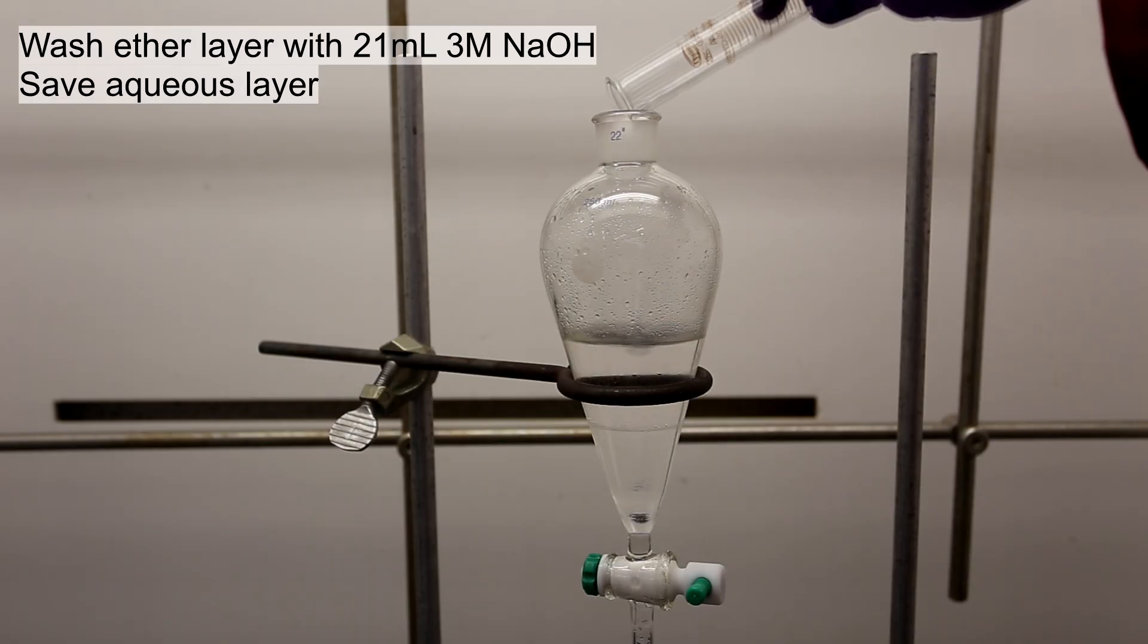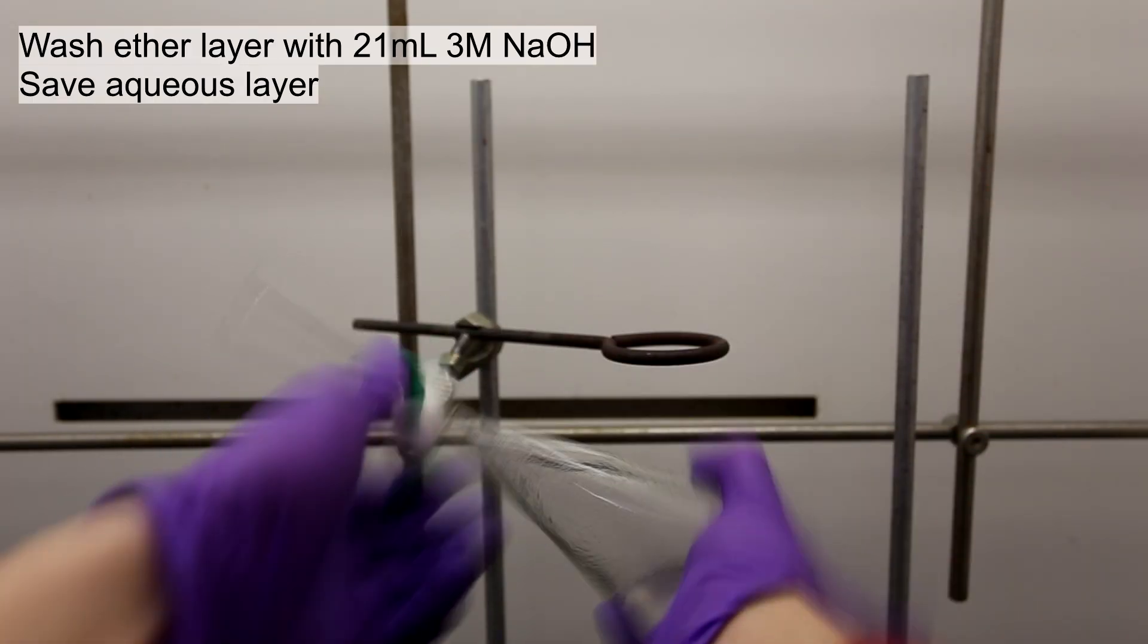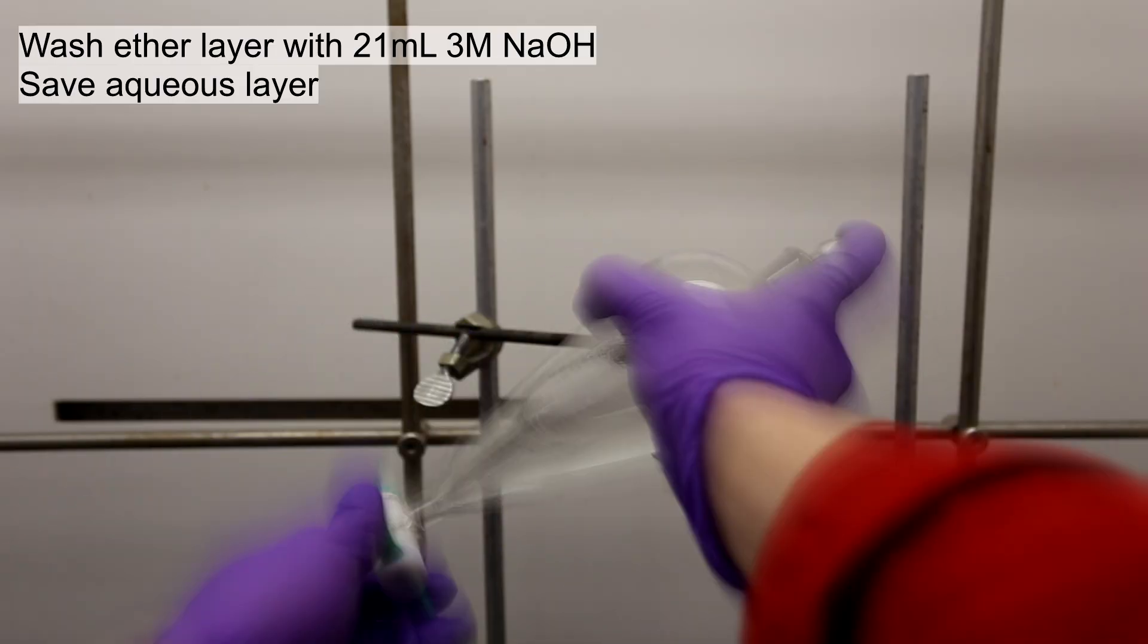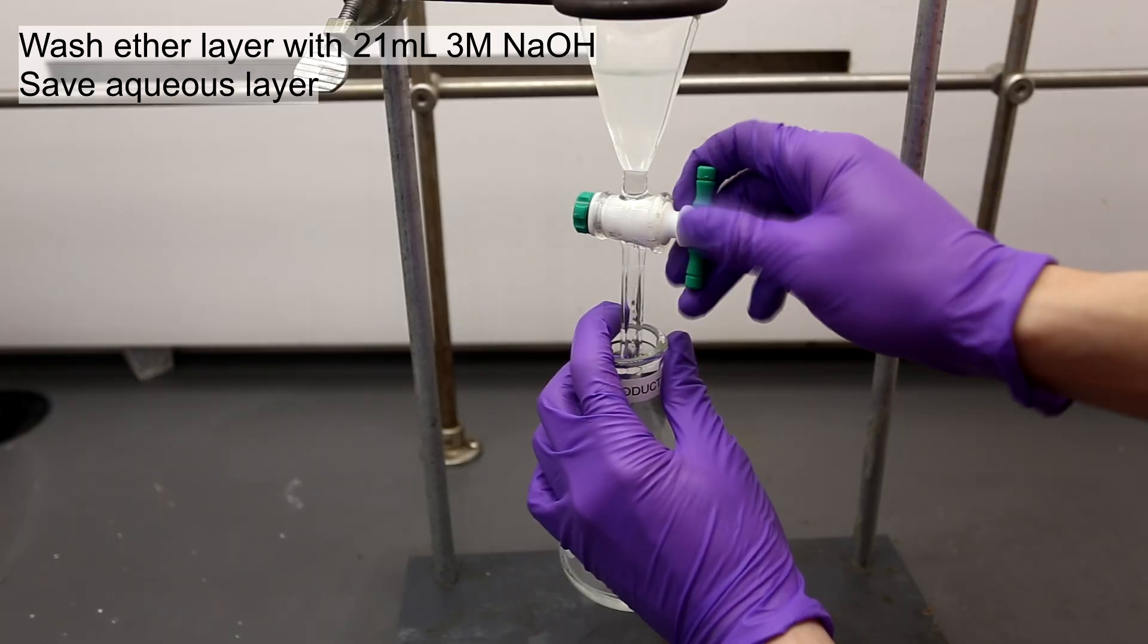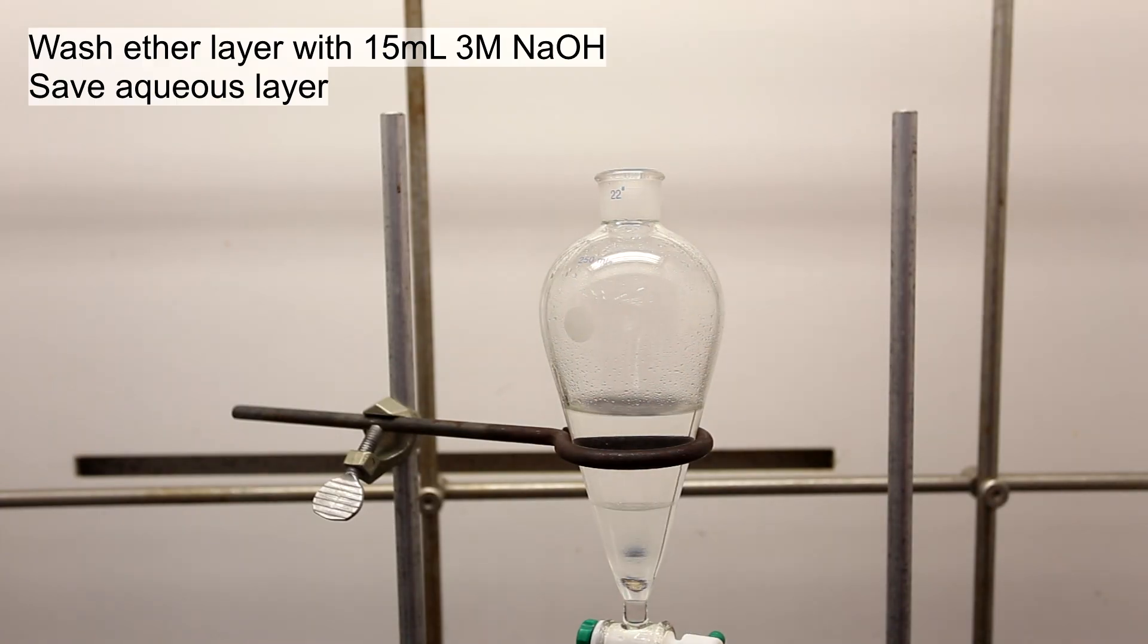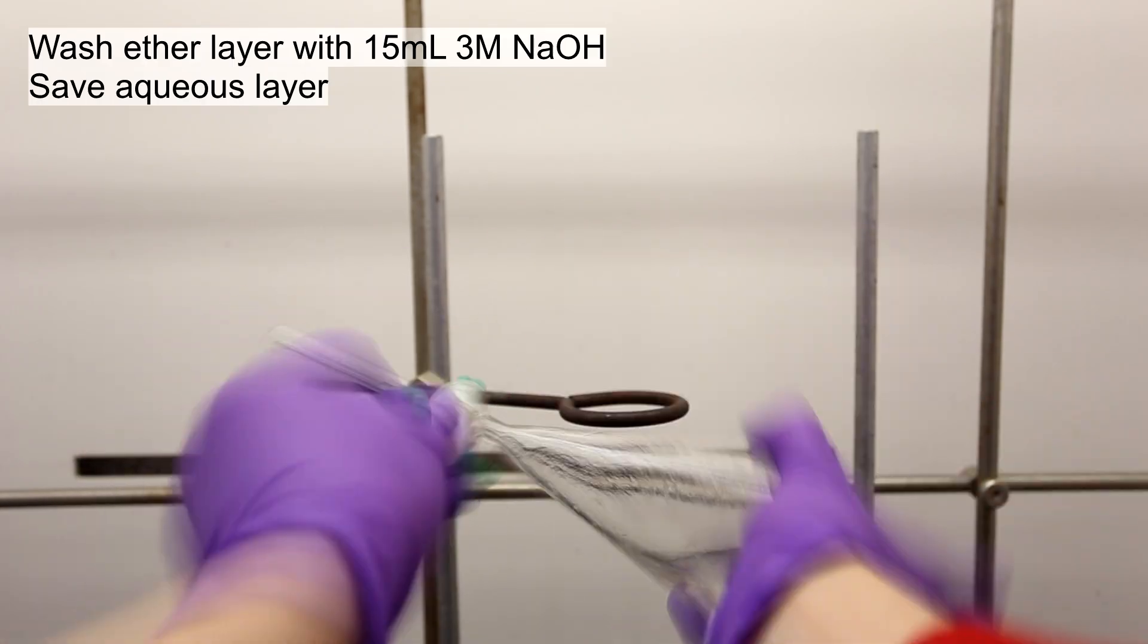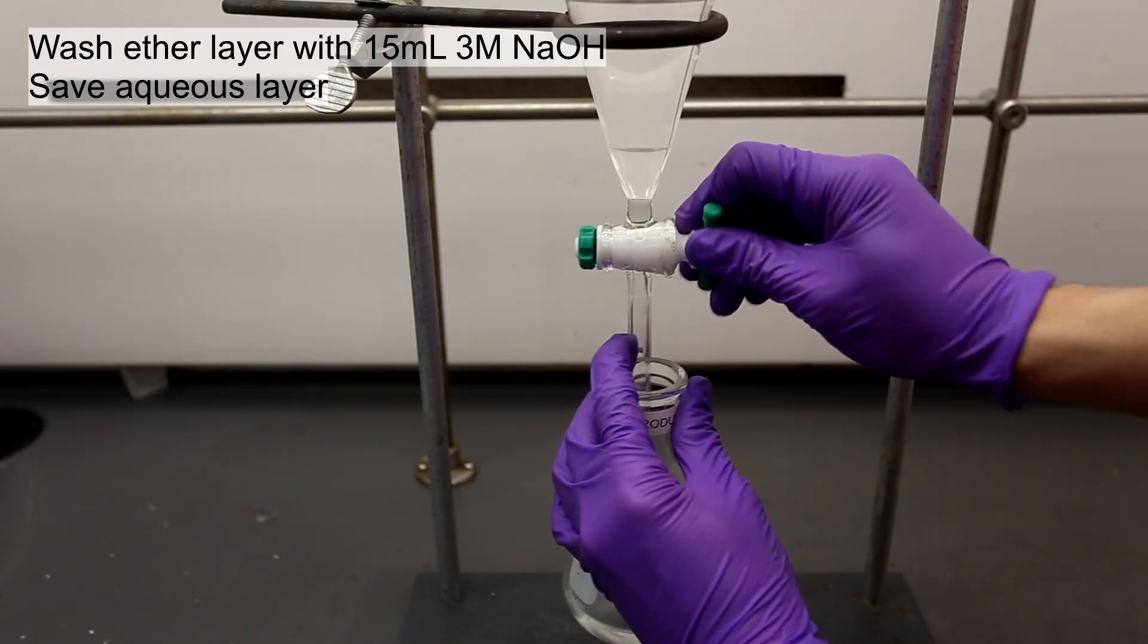Then wash the ether layer with 21 milliliters of 3 molar sodium hydroxide and save the aqueous layer this time. This neutralizes the butyric acid and brings the sodium butyrate into the aqueous layer. Wash the ether layer again with 15 milliliters of 3 molar sodium hydroxide and again save the aqueous layer.